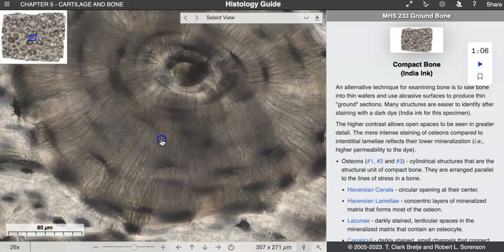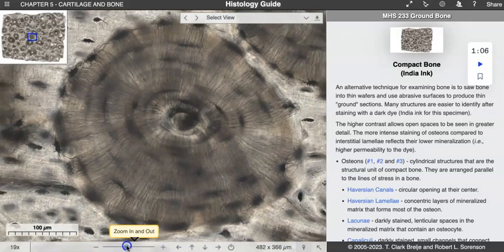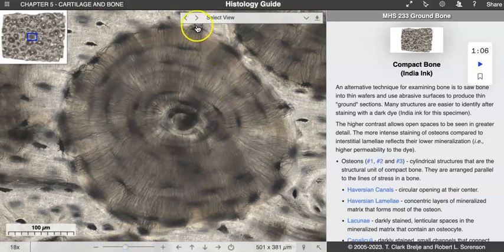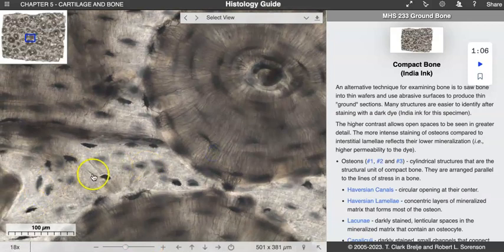So you can see how many living cells would be existing in one little osteon, right? Quite a few make up this entire osteon, and they exist even within the lamellar layers out to the side. And so what is all of this here? Well, that's considered to be lamellae as well, or layers of bone matrix. And it doesn't have a pattern like an osteon would, so we usually refer to that as interstitial lamellae, okay?